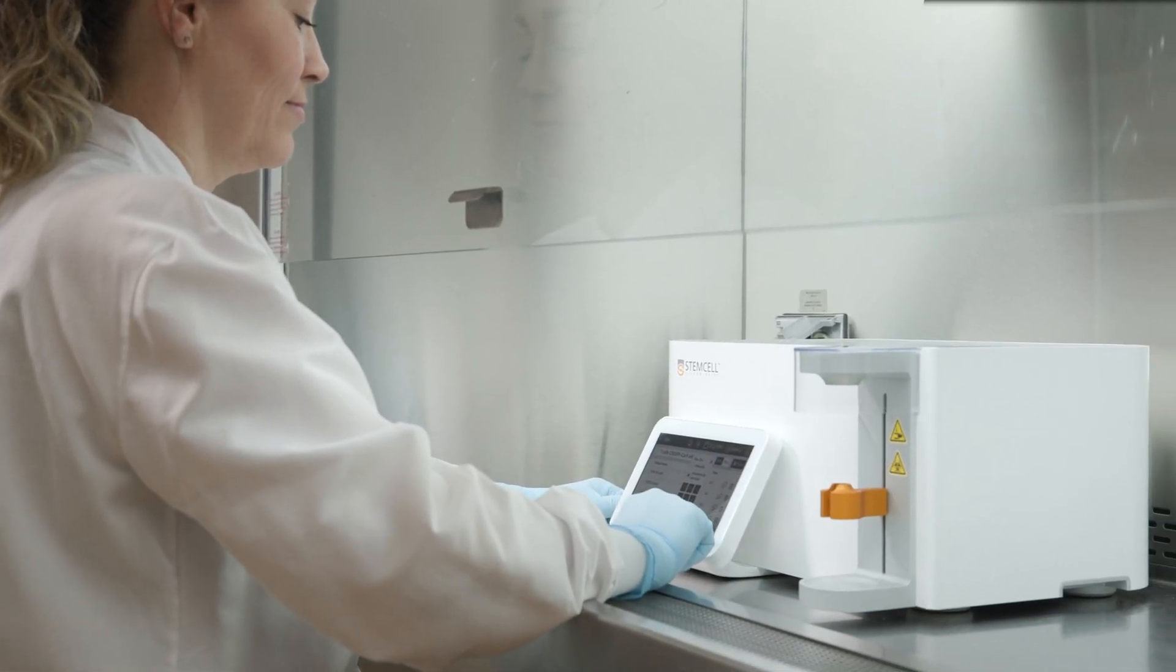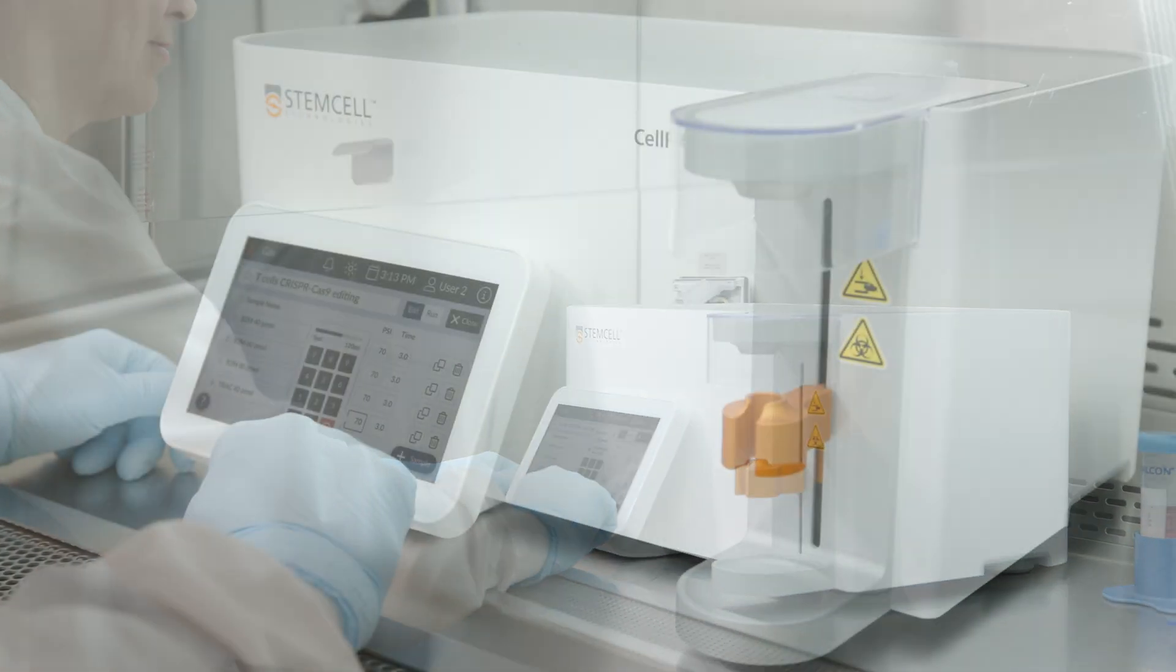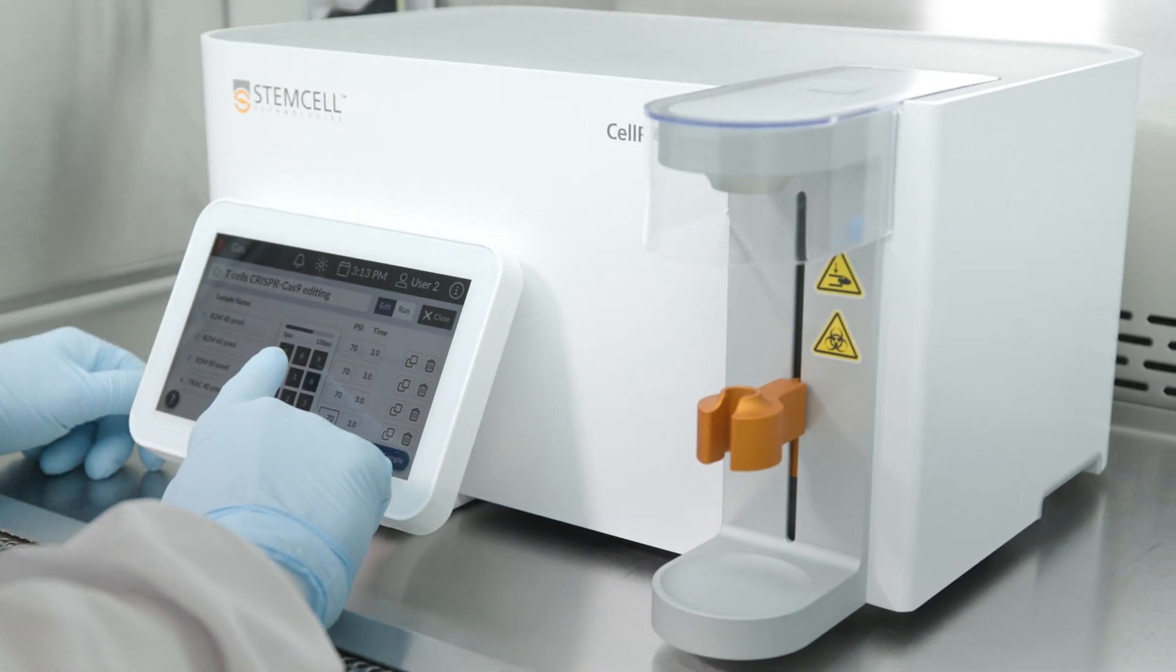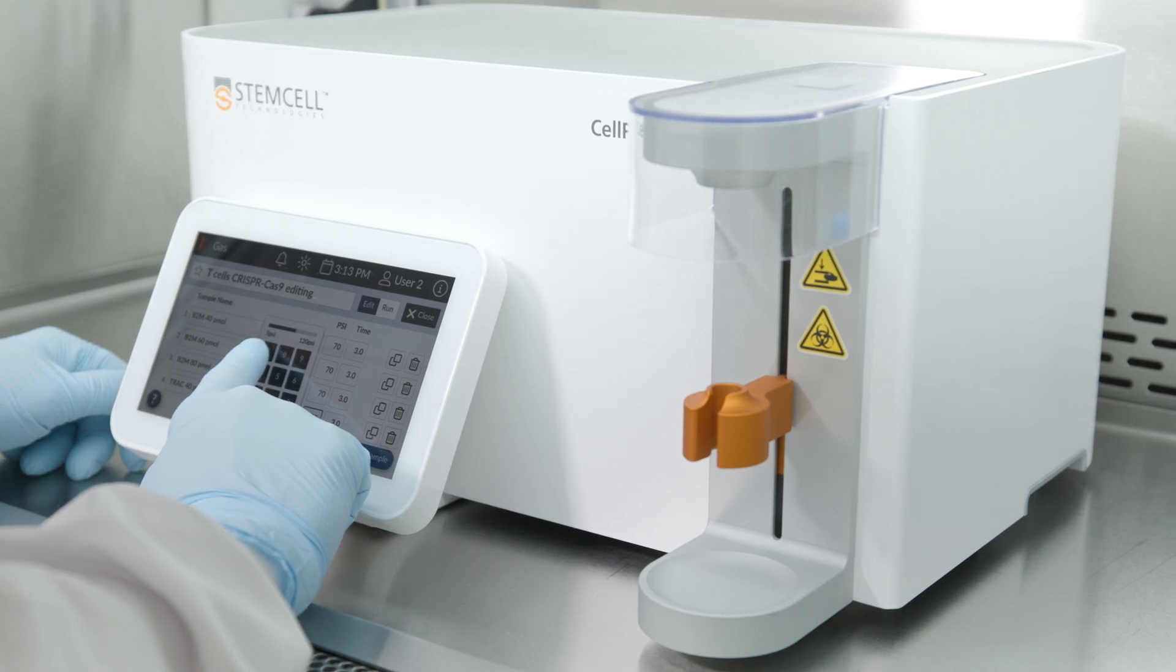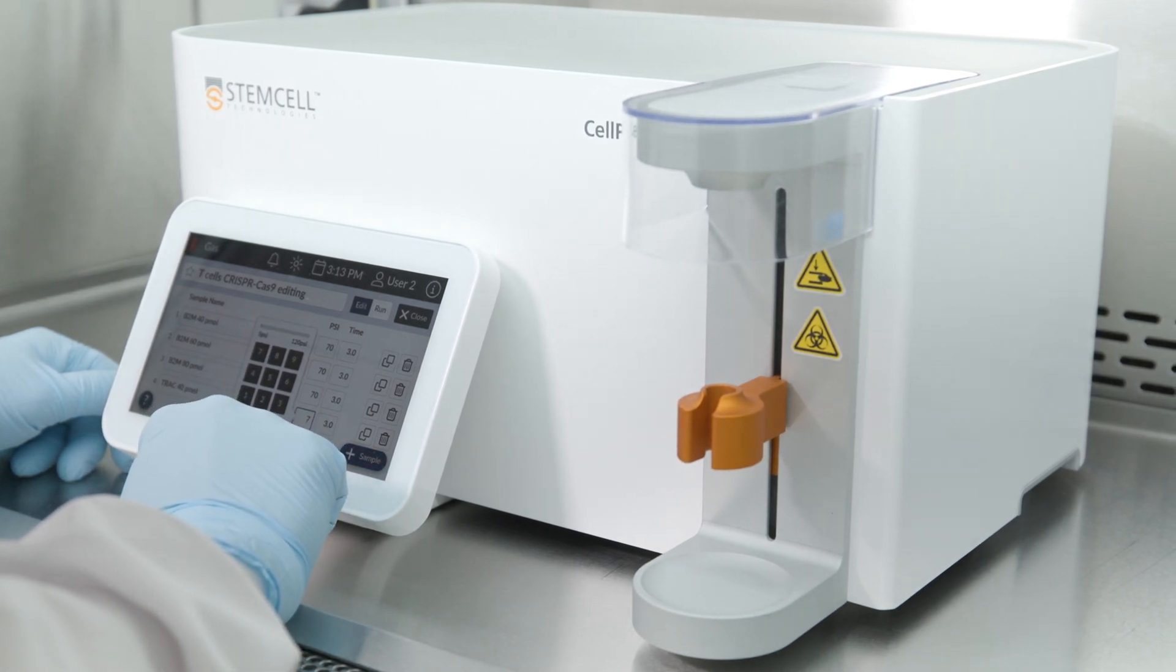To address these challenges, STEMCELL Technologies developed the CellPore Transfection System, a benchtop device for gentle yet efficient delivery of molecules to a range of cell types.